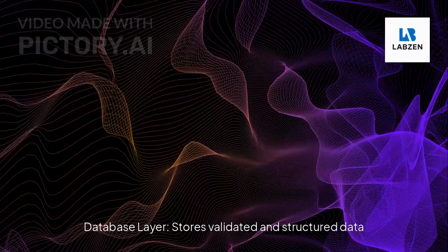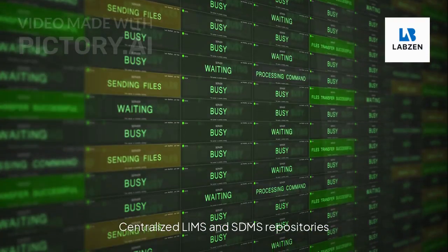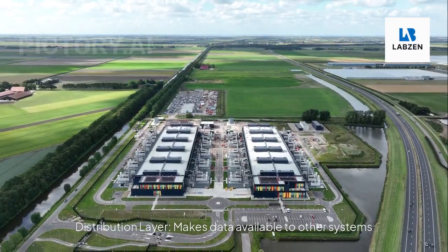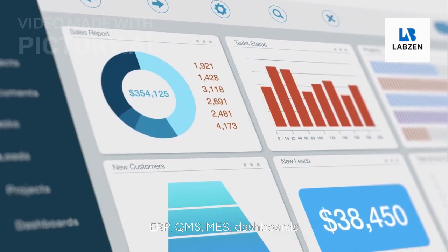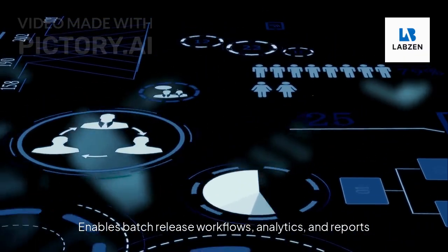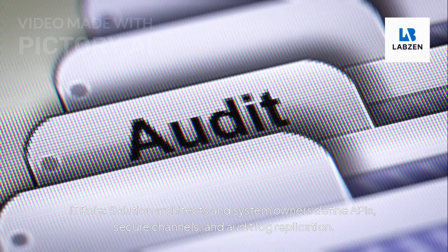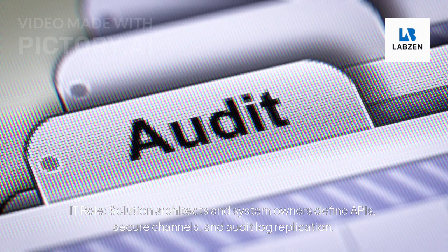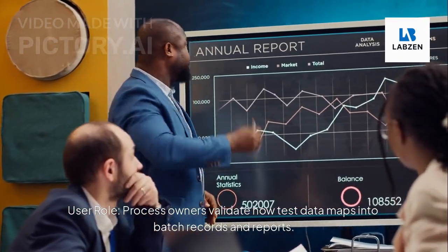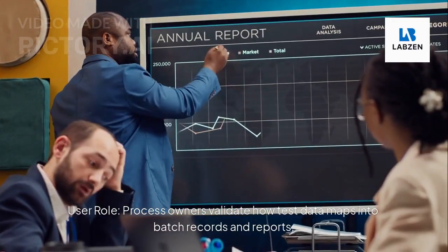Database layer stores validated and structured data. Centralized LIMS and SDMS repositories are designed with audit trails, timestamps, and ALCOA Plus compliance. Distribution layer makes data available to other systems: ERP, QMS, MES, and dashboards. It enables batch release workflows, analytics, and reports. IT role: solution architects and system owners define APIs, secure channels, and audit log replication. User role: process owners validate how test data maps into batch records and reports.